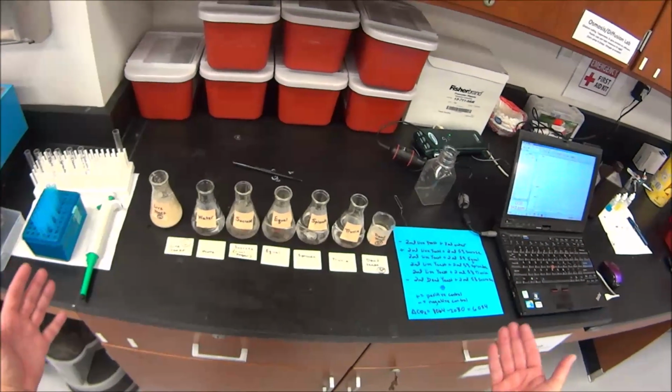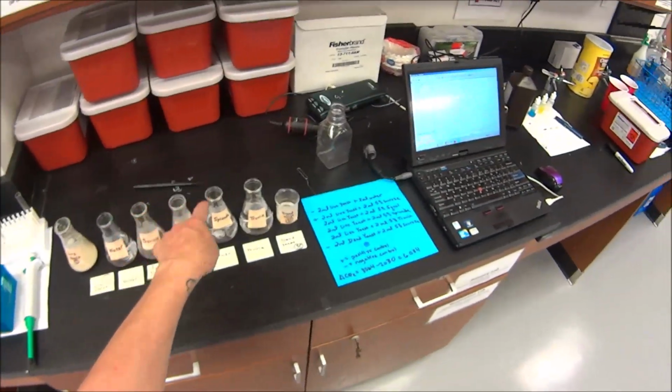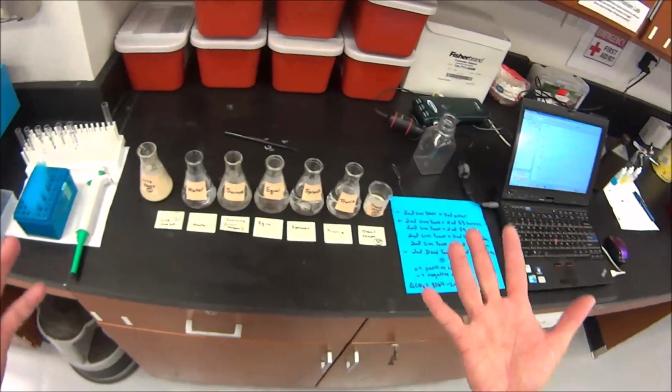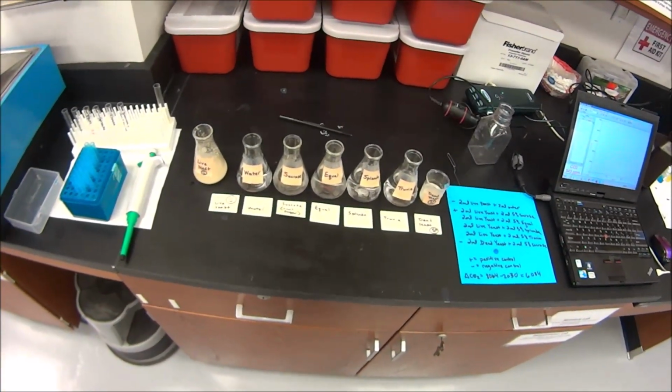Welcome to the Cell Metabolism Lab, where I've prepared seven beakers and Erlenmeyer flasks. Okay, so here is what we've got. I know you can read it.